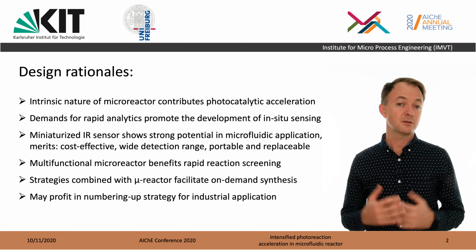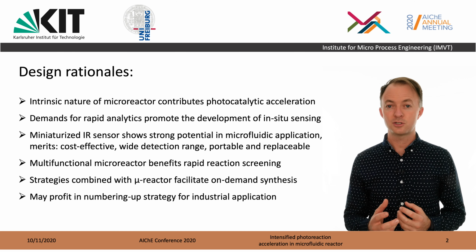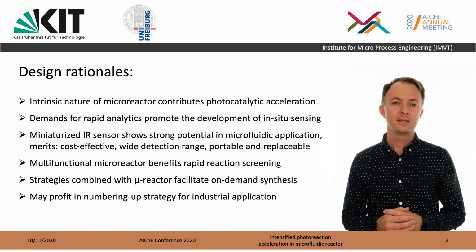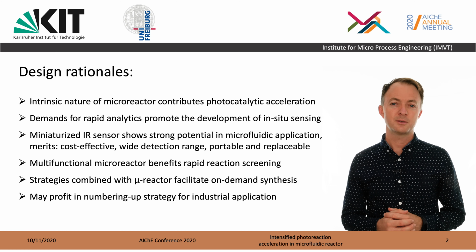Optical sensors are an excellent category of sensor because typically they don't interfere with the reaction, the progress, or the composition. And we obviously are dealing with microfluidic channels, so we want to have a miniaturized sensor. So what we're going to present is our concept of a miniaturized optical sensor.